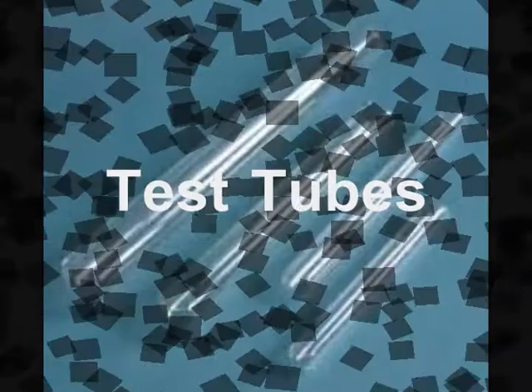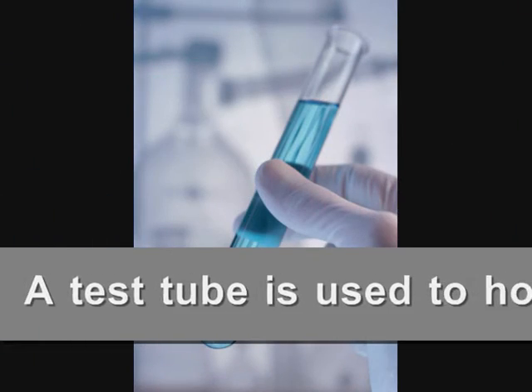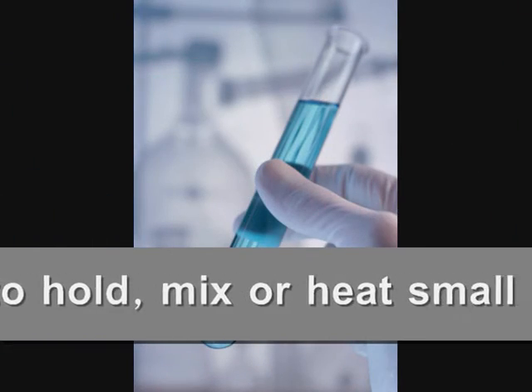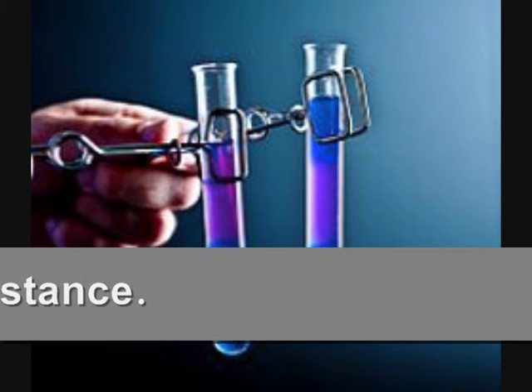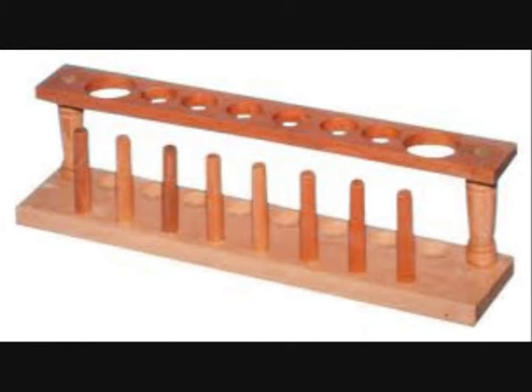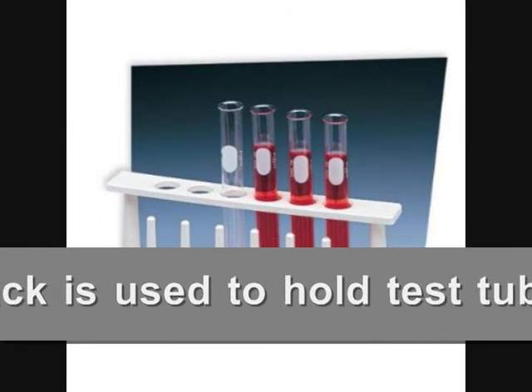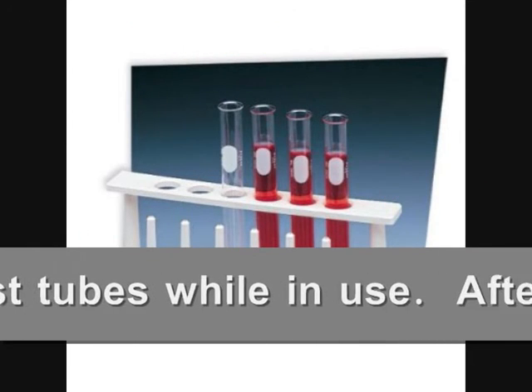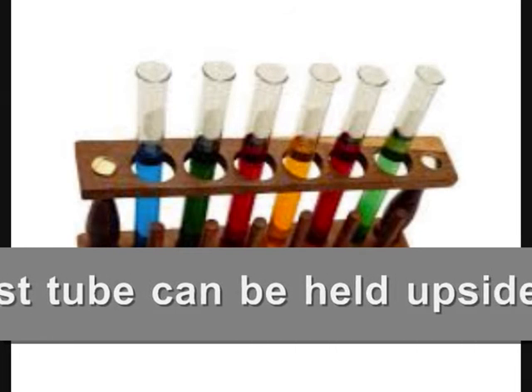Test tubes. Test tubes are used to hold, mix, or heat small amounts of a substance in the lab. Test tube rack. A test tube rack is used to hold the test tubes since they do not have a base on them. It is also where test tubes are turned upside down and held on pegs to dry.